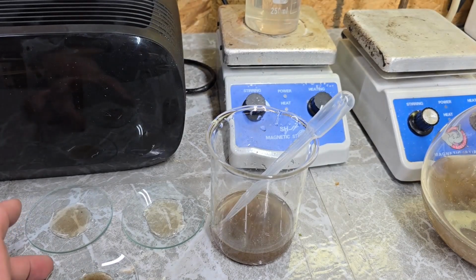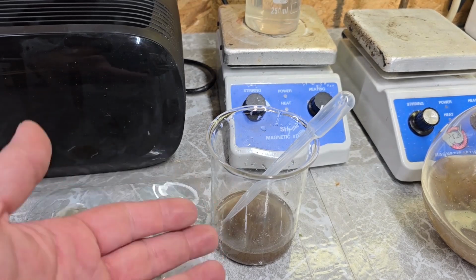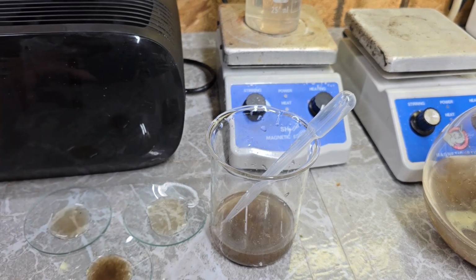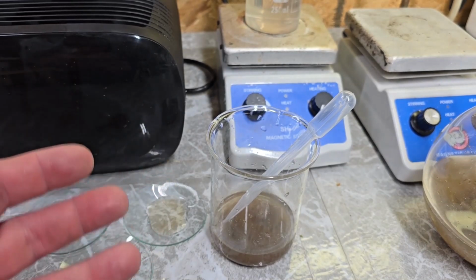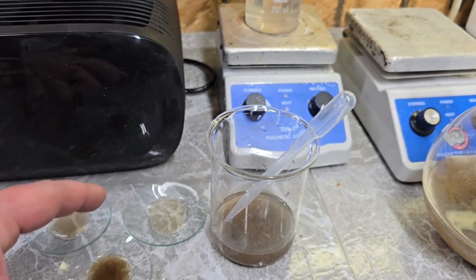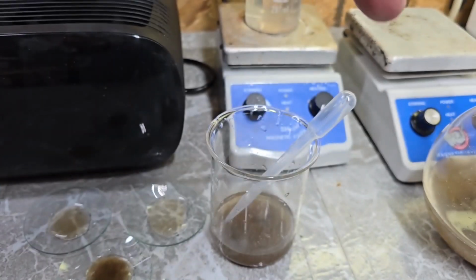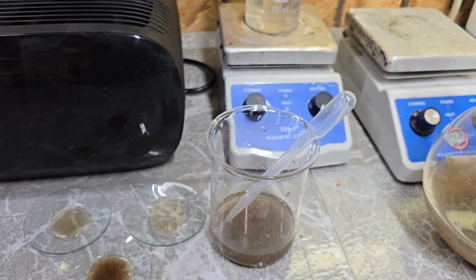So now I'm going to carefully take these little watch glasses that have our water from our concentrated critter roundup method, whatever you want to call it. I'm going to put them underneath my stereo microscope and just see what I can find. If I find anything worth looking at, I'll turn the camera on and show you. If I don't, I'll put the sample back into the boiling flask and keep looking until I find something worth checking out on camera.